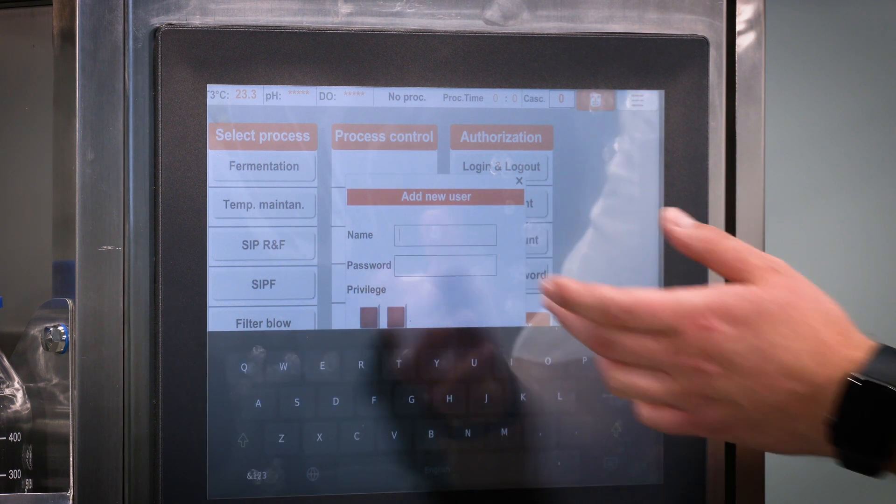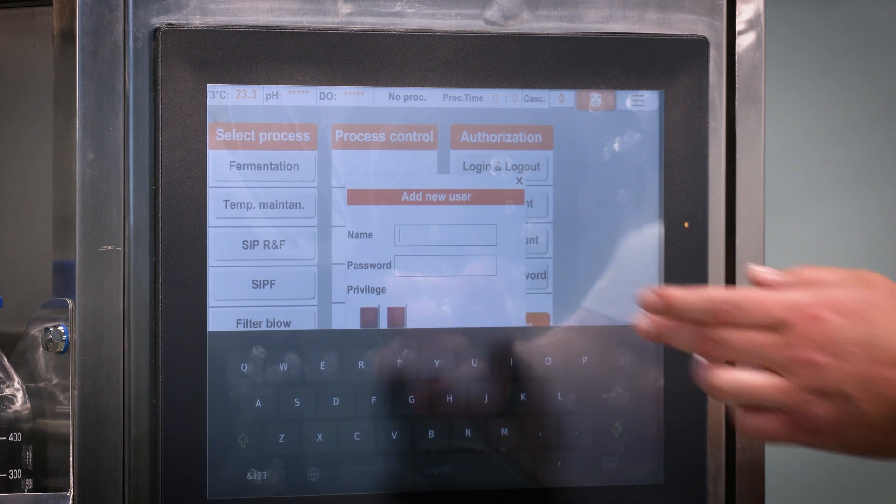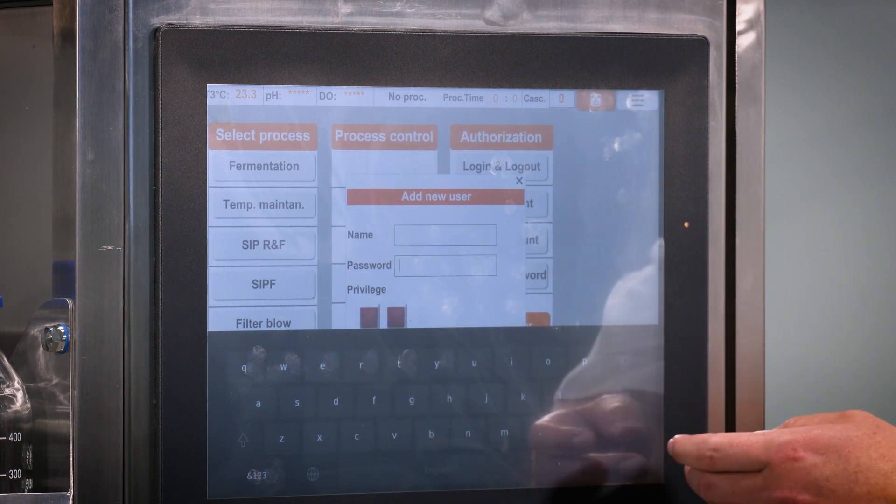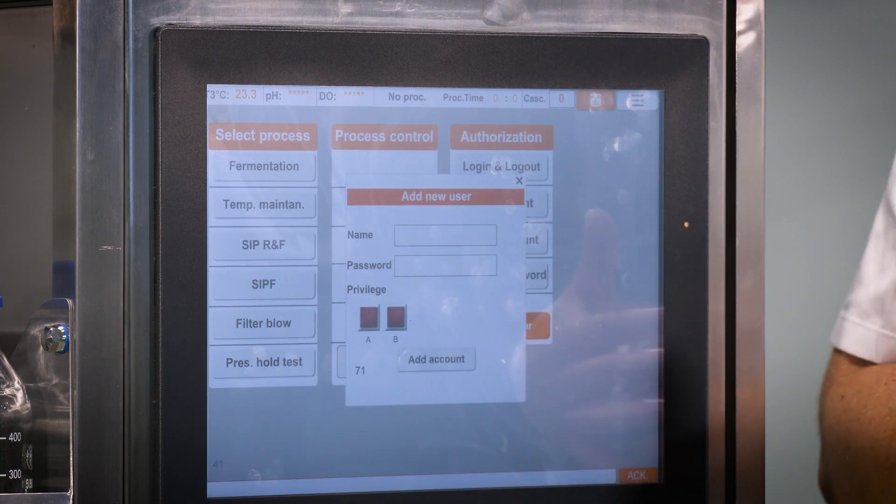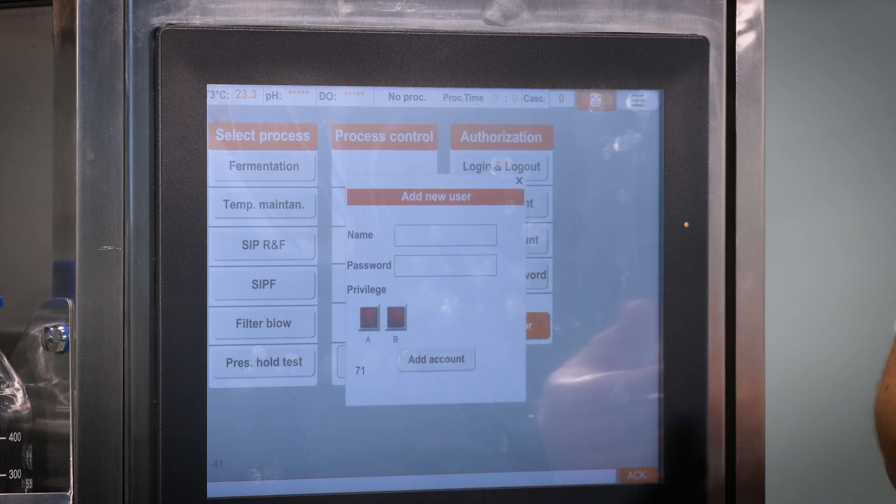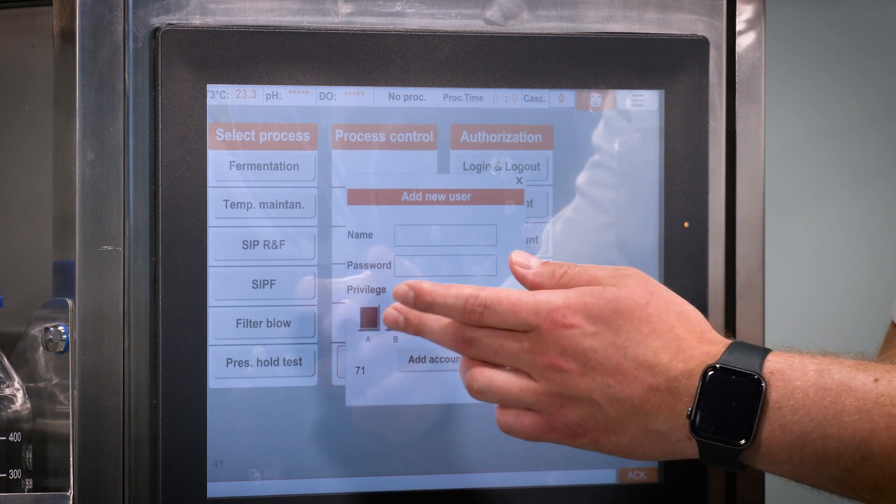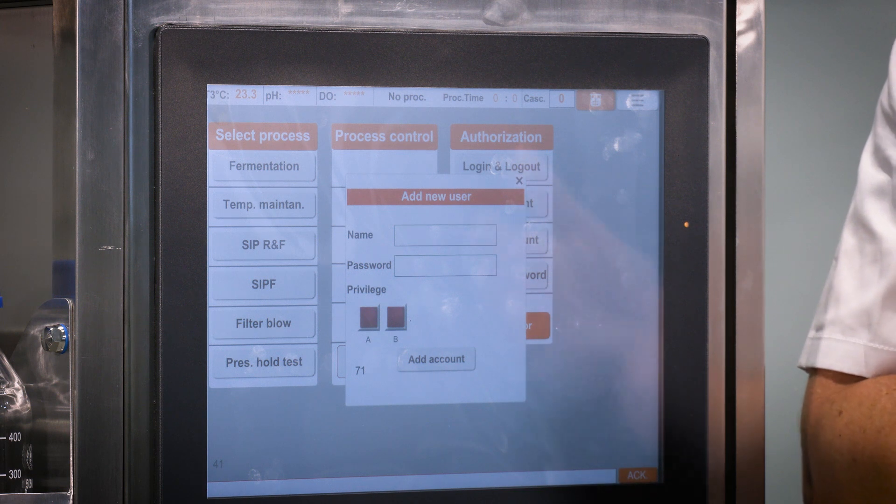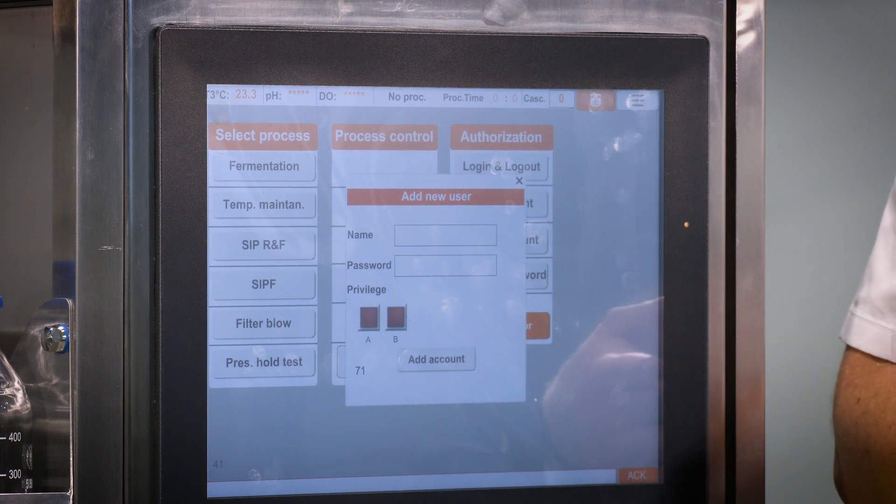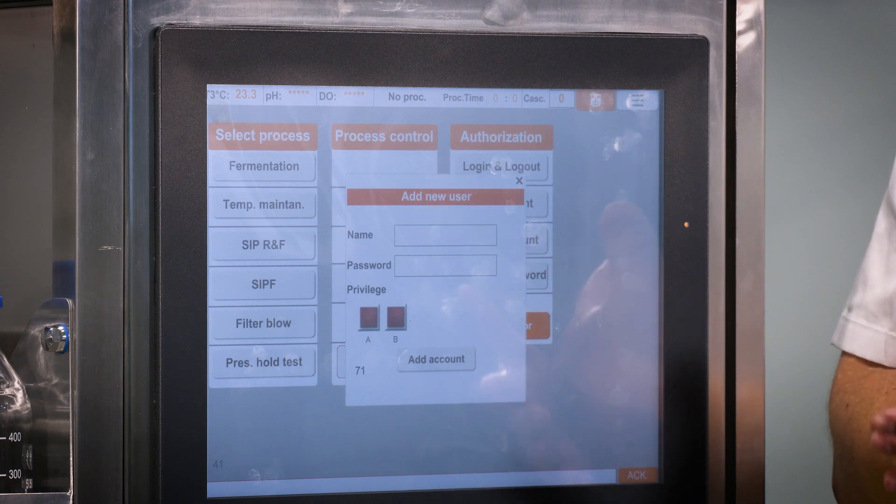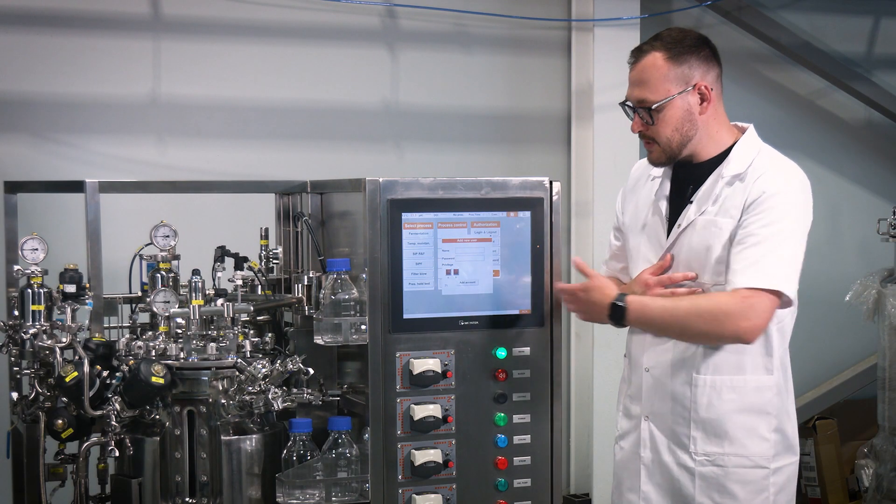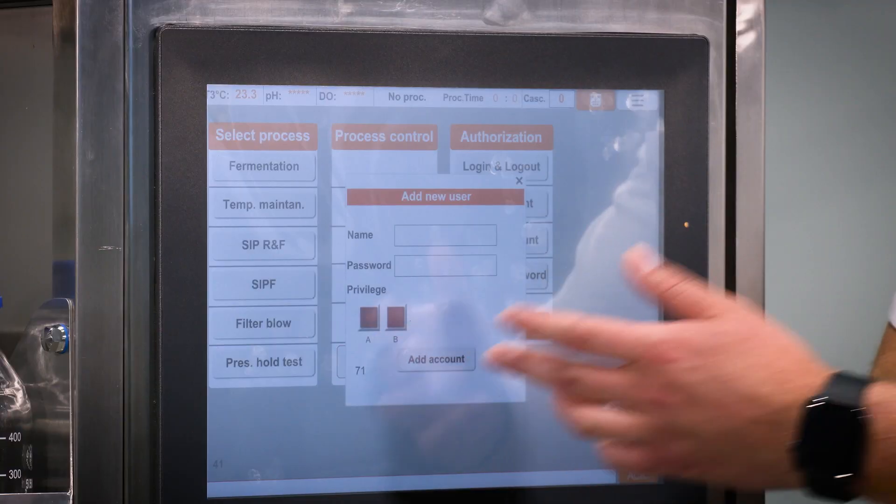Select the new user's name and password by clicking on the respective blank spaces. Also select the appropriate access level A, B or AB to choose whether the new user will have controller level access or operator level access. After this procedure is complete, press the add user button.